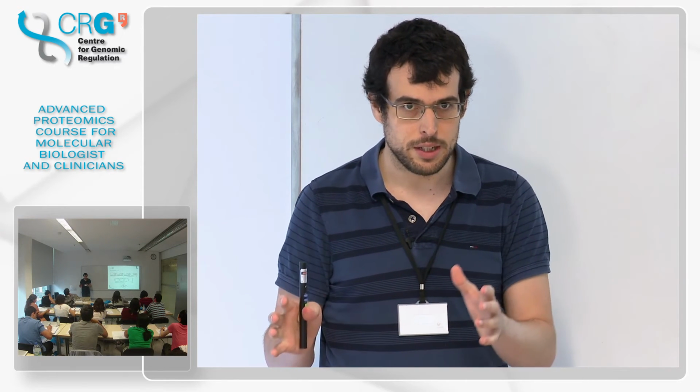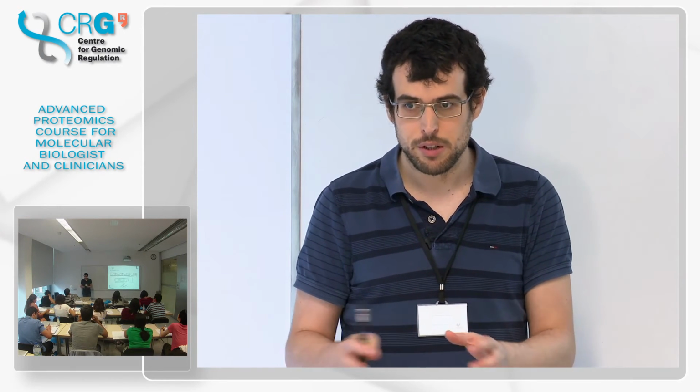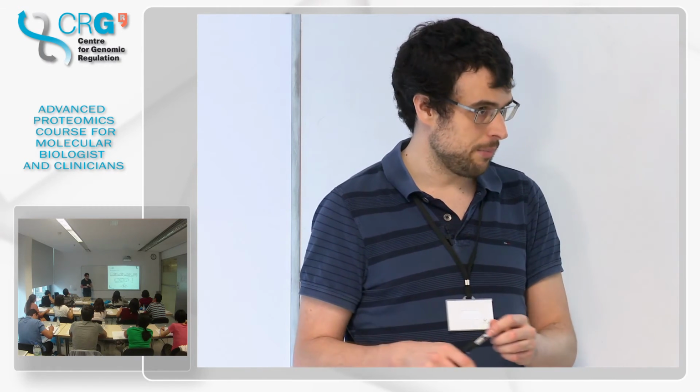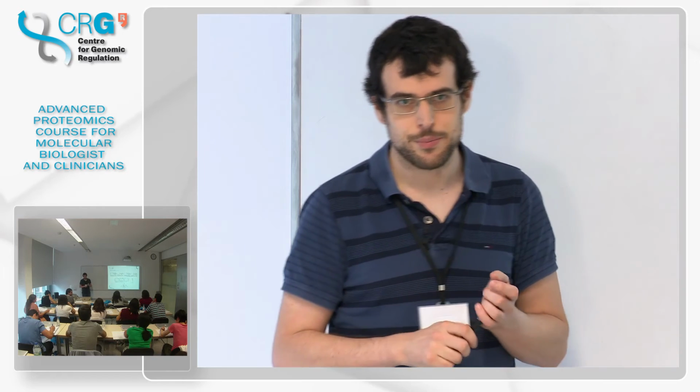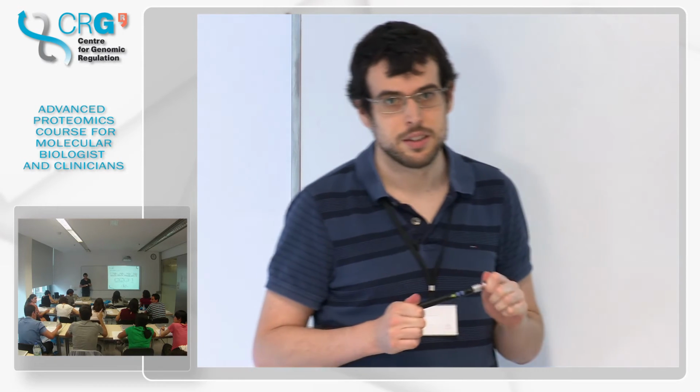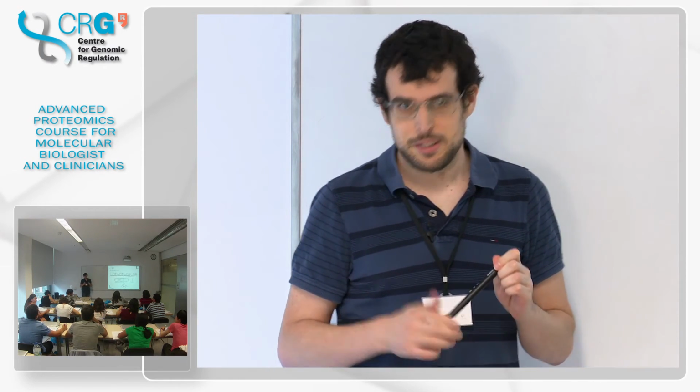Okay, so we are always analyzing peptides that are digested from a protein sample, and then we analyze the peptides. There is, for instance, one protein which has never been in the top 3, but it's always top 4. We'll never sequence that protein. Yeah, so this is true.